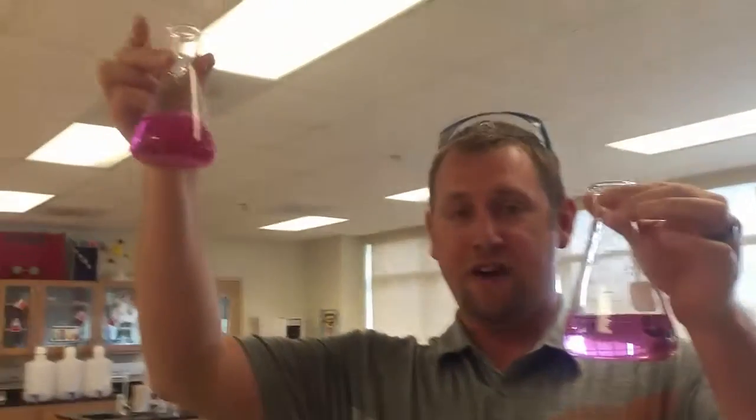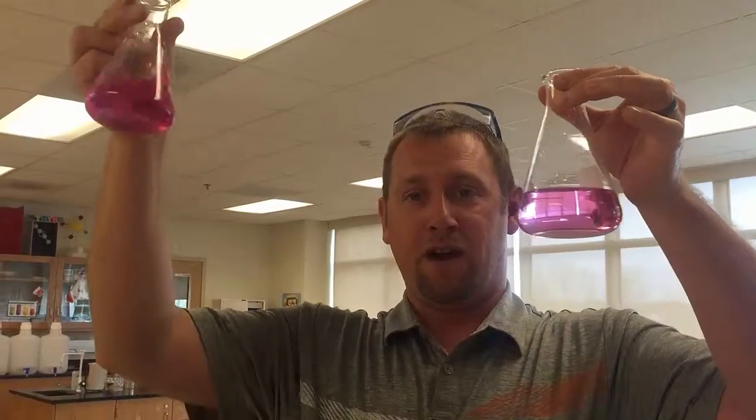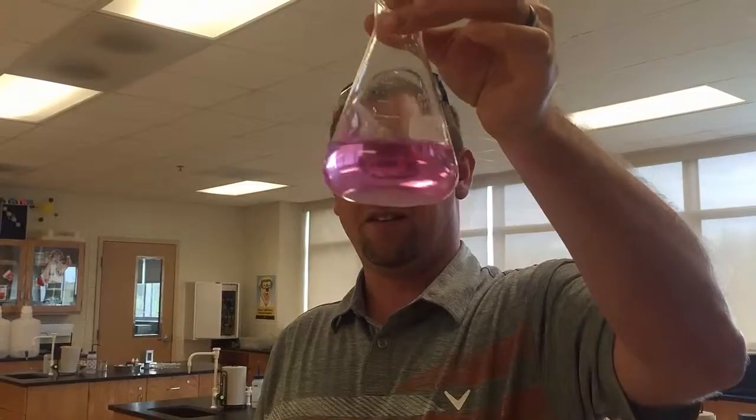Here we have two different flasks. Here is my rough estimate flask. Here was my little bit better. I think it could have been better yet. You can tell because this one in my right hand is way darker than this one. That's because I went way over with the sodium hydroxide as opposed to this one. Again, the fainter the pink, the better you are at titrating.